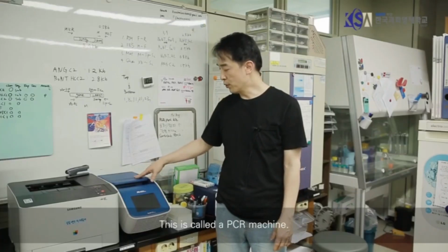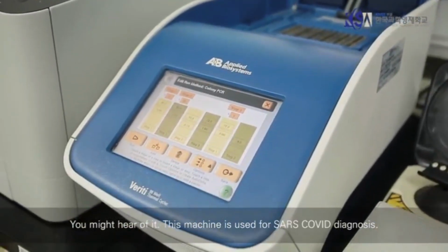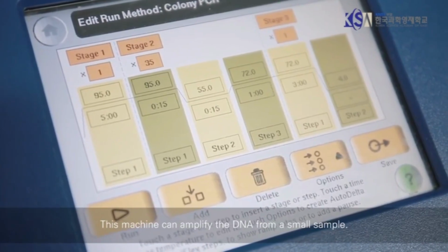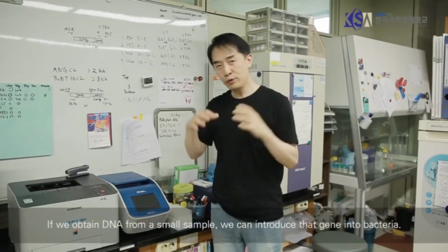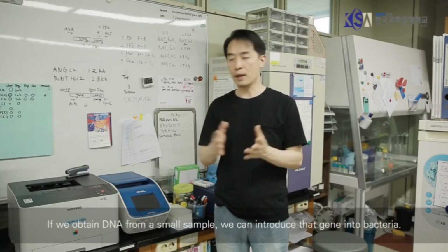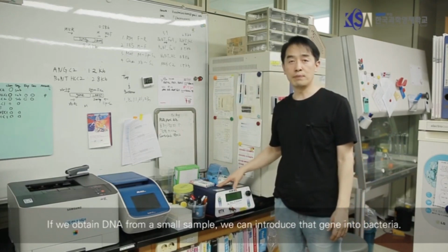This is called a PCR machine. You might have heard of it because of SARS-CoV diagnosis. This machine can amplify the DNA from a small sample. And if we obtain some DNA from the small sample, then we can introduce that gene into the bacteria.